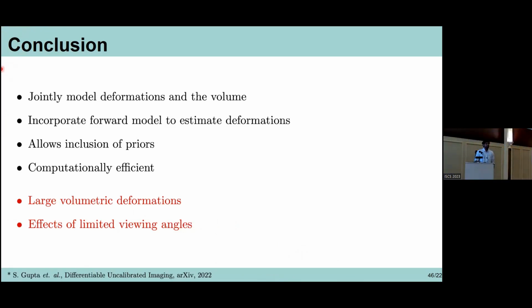How would this model stand up to compressing the viewing angles? If you did compressed tomography where you don't take a linear section, how would that stand up? Can you repeat that question? If you subsample the viewing angles, so rather than taking every 2 degrees or 5 degrees you take a random set of acquisitions, could this model be updated to include that implicitly? I think when you subsample the viewing direction, you need to incorporate certain priors, which we do not do here, but in the cost function there's no problem in adding a prior to the data.